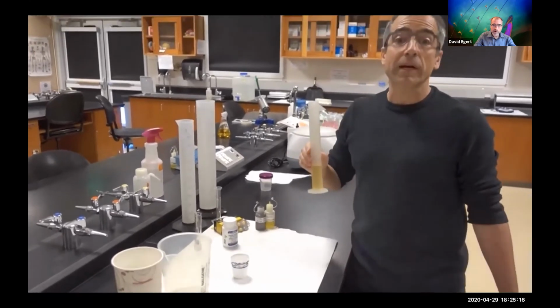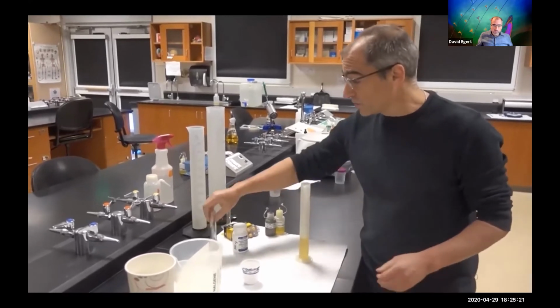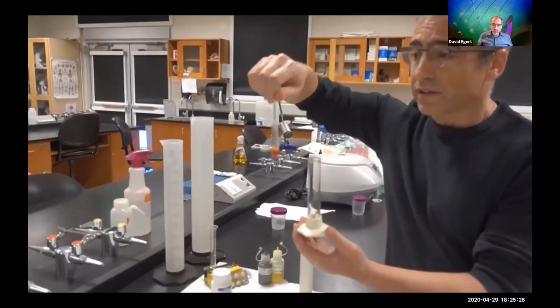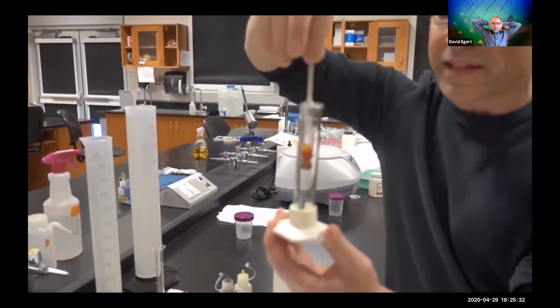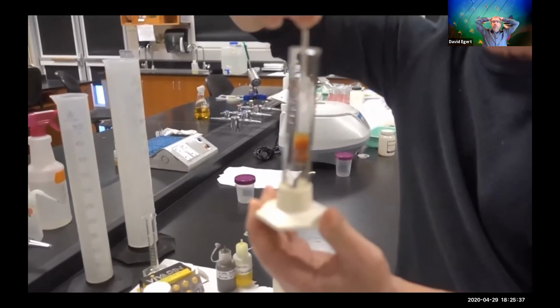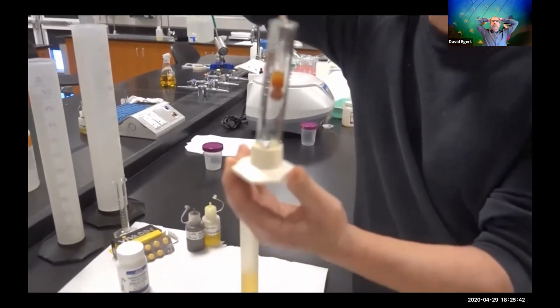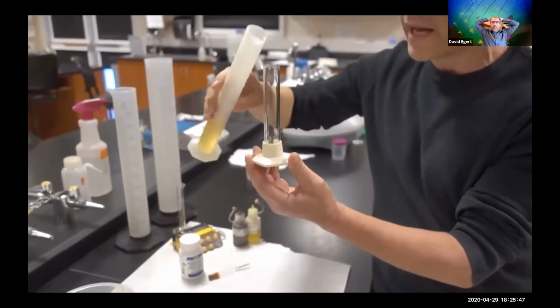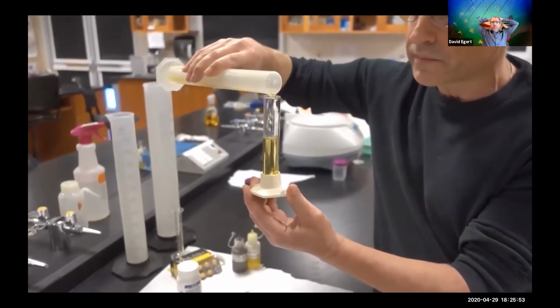I'm also going to want to measure its specific gravity. For the specific gravity, I'm going to use this urinometer. It's basically a little vial and this float, kind of a hydrometer, like if you were making beer. It's the same idea. Depending on the density of the urine, this little float will float further up or sink further down, and the level of the urine on this little scale here is going to tell us the specific gravity.